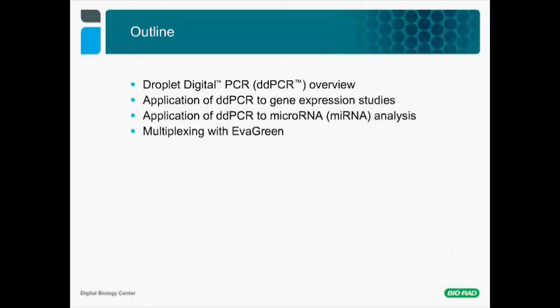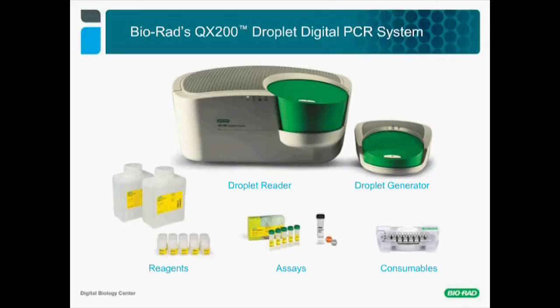Here is Bio-Rad's QX200 Droplet Digital PCR System. It consists of two instruments: the droplet generator and the droplet reader. Bio-Rad offers all the necessary reagents to perform digital PCR in droplets. The droplet generator uses a disposable DG-8 cartridge to simultaneously partition eight independent 20-µL reactions into 20,000 droplets each, all in about two minutes. The droplet reader instrument can read a full 96-well plate in about two and a half hours, allowing for broad sample throughput—from one to several hundred samples in a single workday.